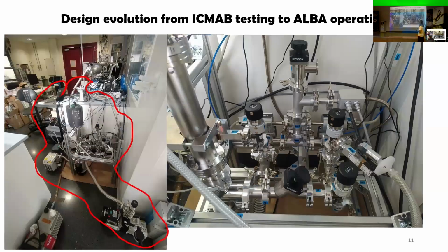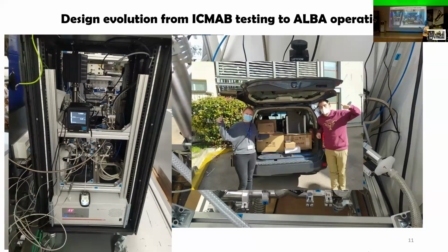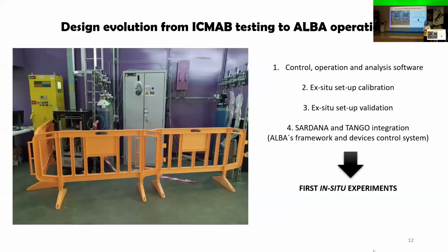Then we needed to fit this into a specially designed frame that would be fitted later to the experimental rack at ALBA Synchrotron. And after testing all of this instrumentation and everything worked correctly, we were ready to move it then to ALBA and fit it to this experimental rack on wheels that permits easily moving it to the beamline hatch and outside the beamline hatch. Everything luckily fitted inside, so we could start with the validation and calibration of this setup.